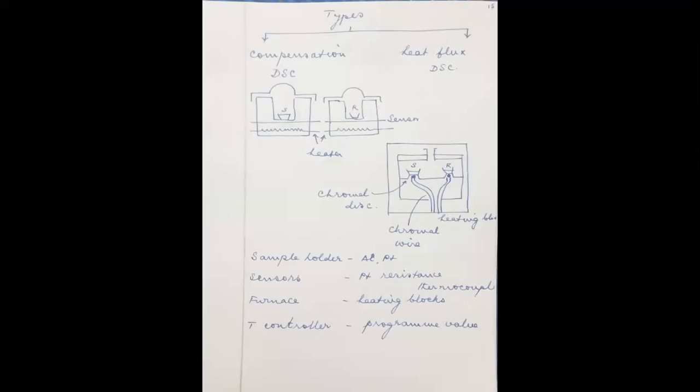and nothing can be interpreted using the data obtained by the differential scanning calorimetry. See, the main business is here. You are not simply measuring the temperature difference, you are very much concerned about the quantity of the heat energy supplied in Joule. So, what is the heat energy supplied? Calorimetry. So, the temperature controller is a very important part of this system, and also the programmer, the computer programming system, plays an important role in controlling the temperature and in controlling the rate of heating of the substance.